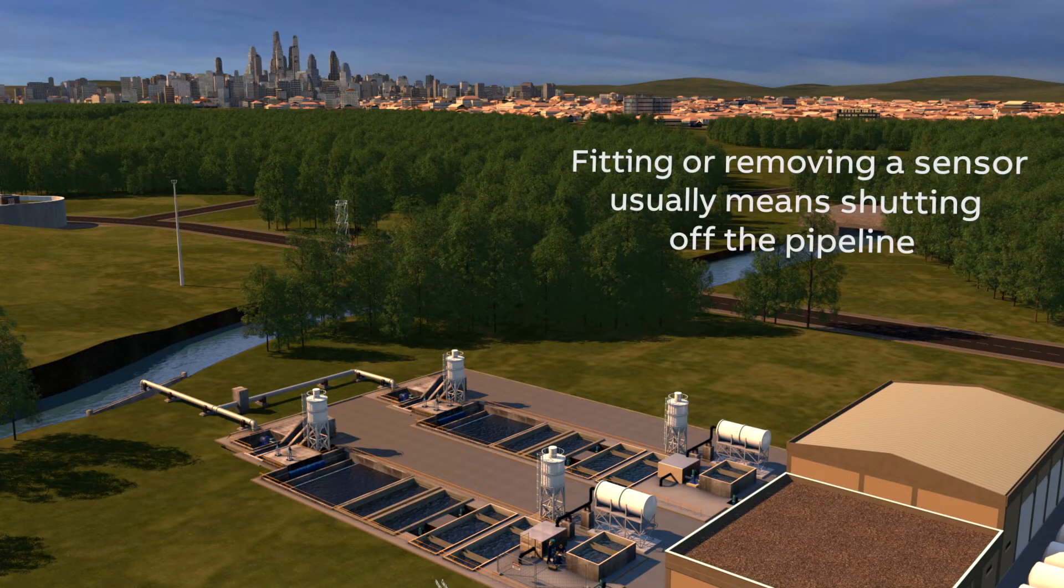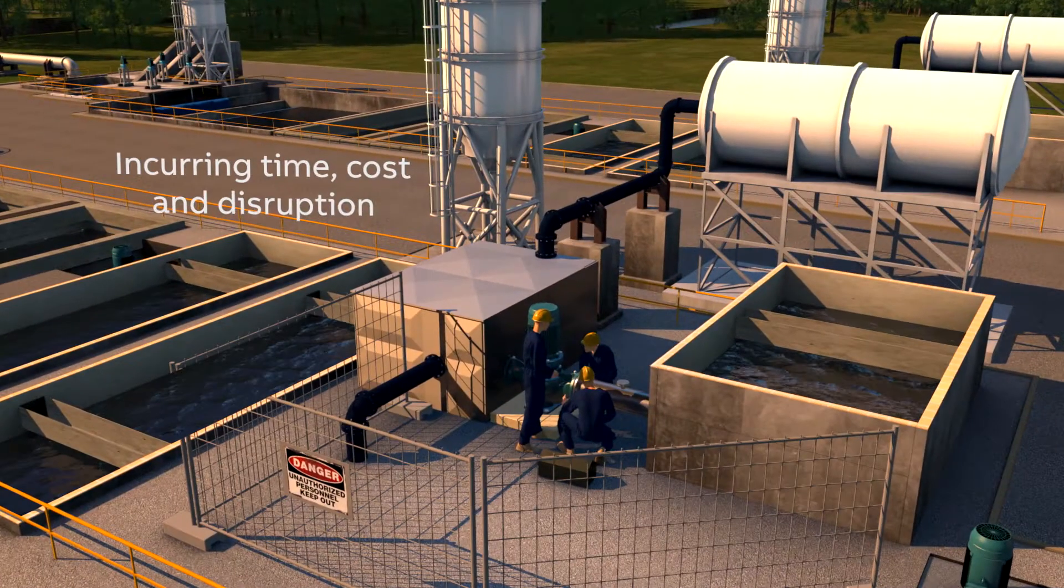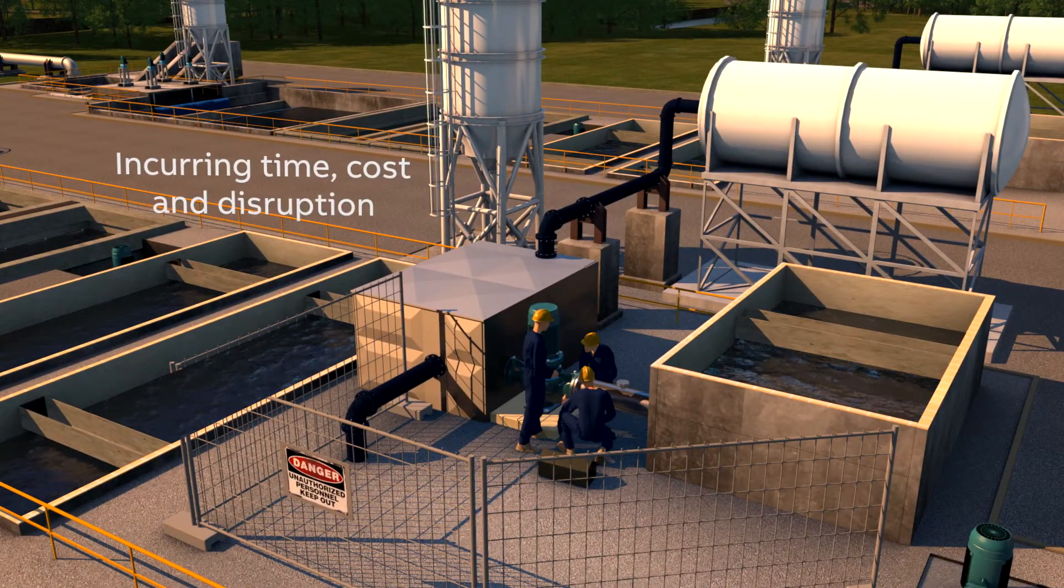Traditionally, fitting or removing a sensor in an existing pipeline has meant shutting off the line first, incurring time, cost, and disruption while the necessary work is carried out.